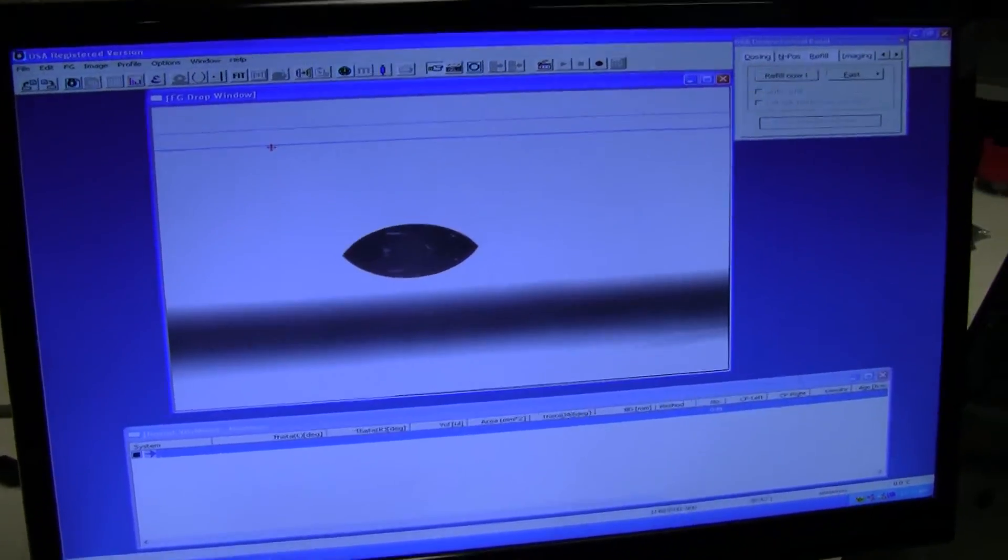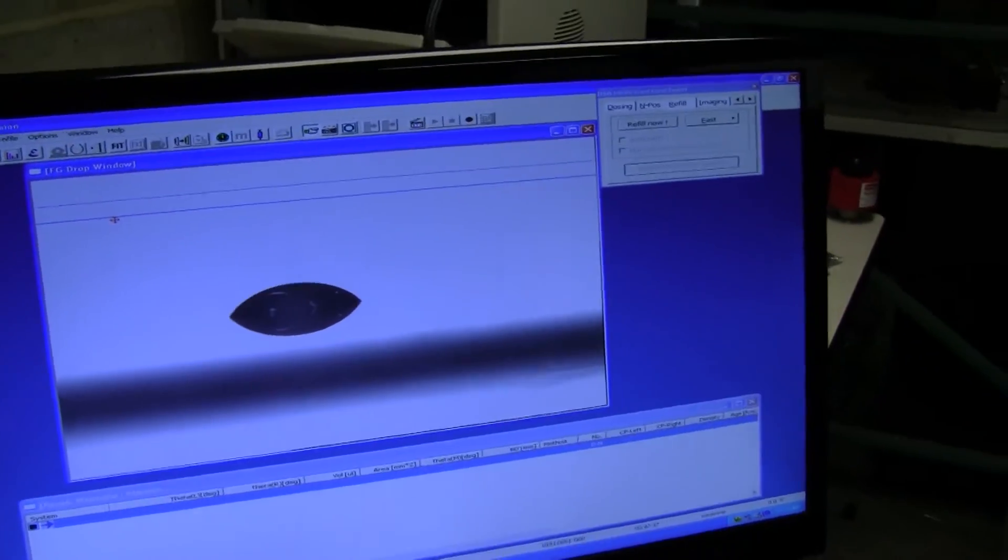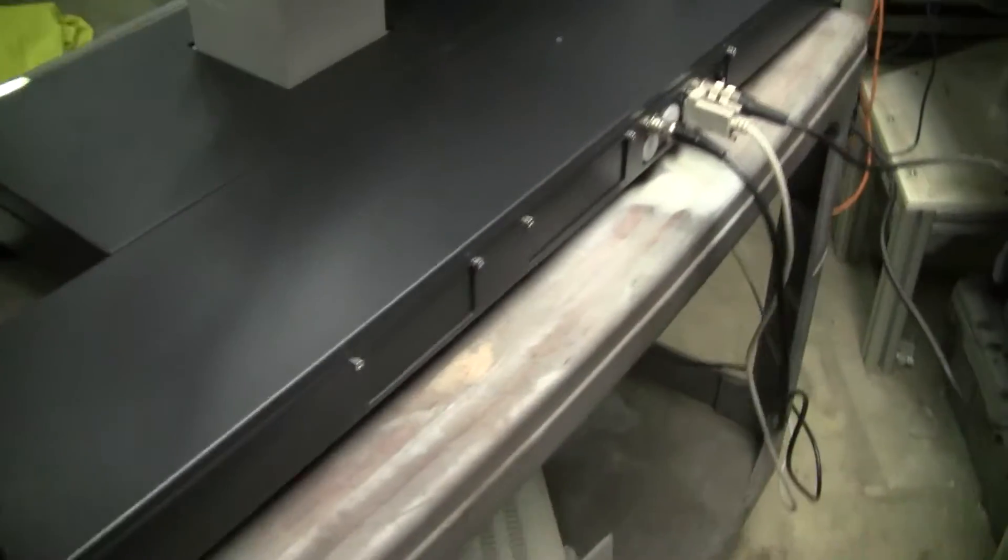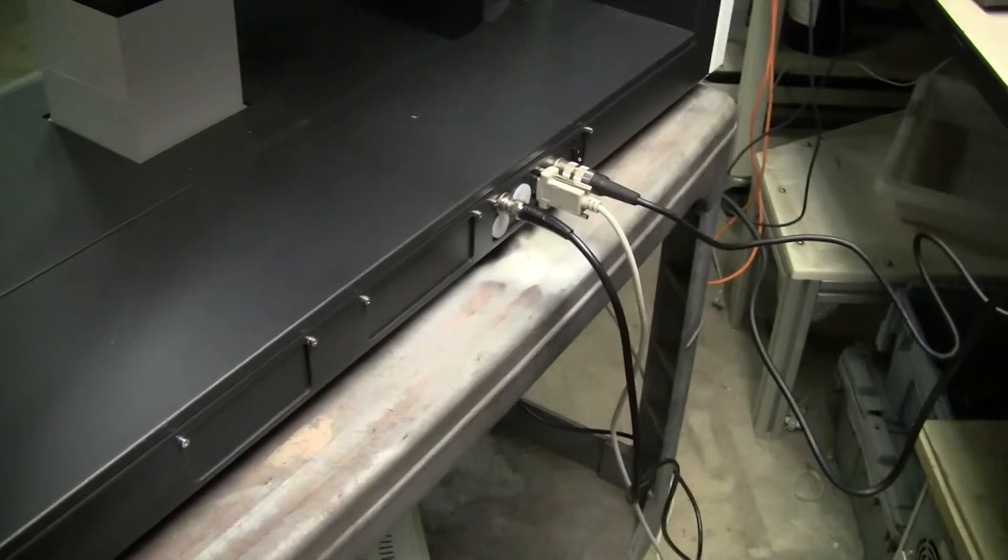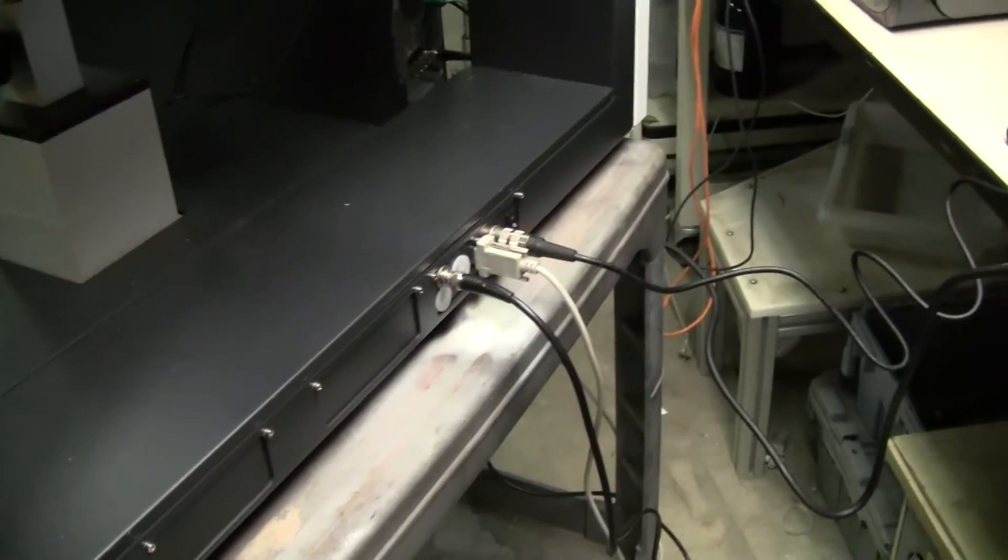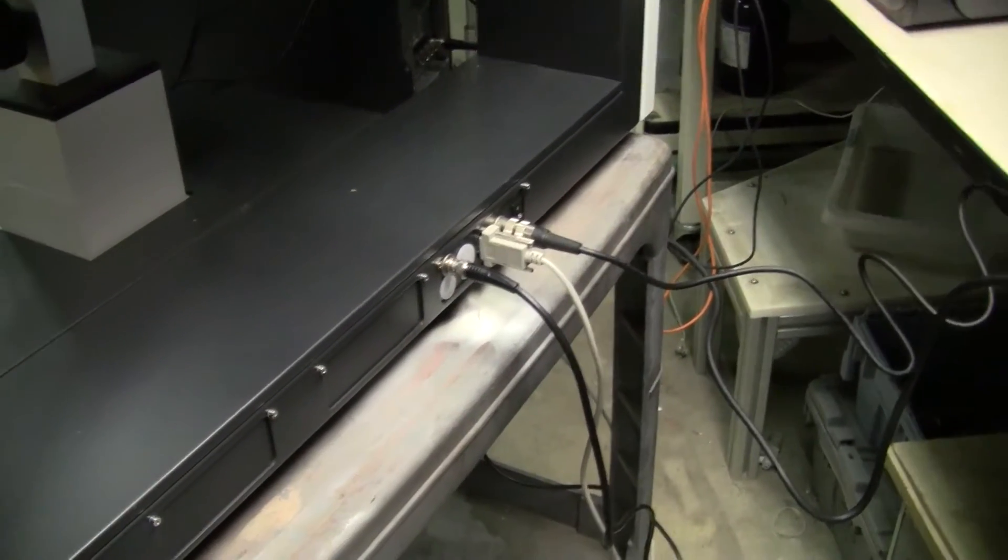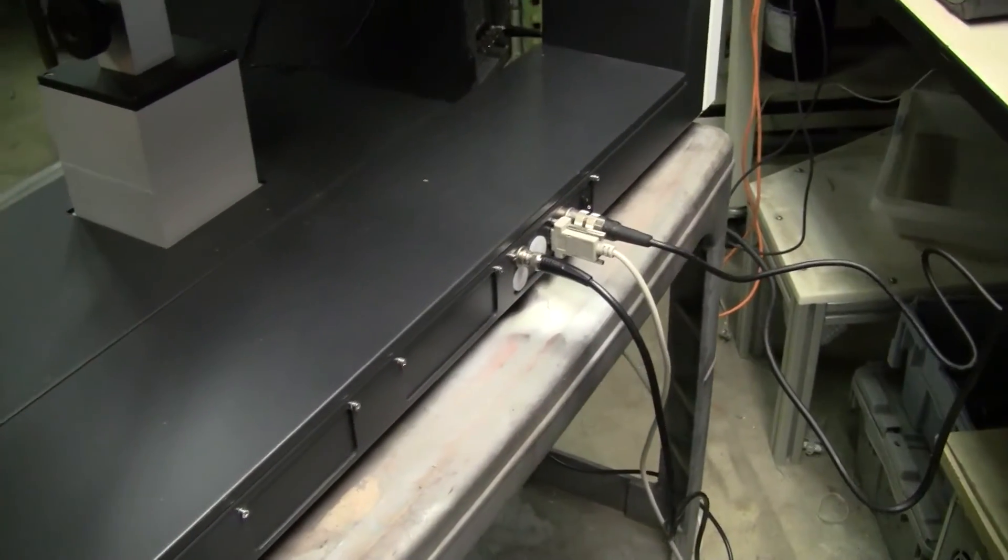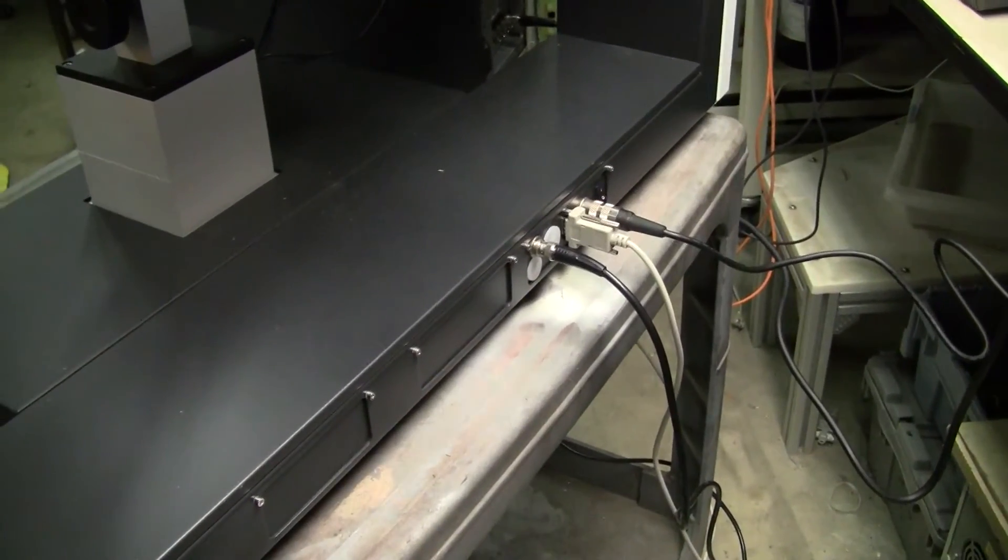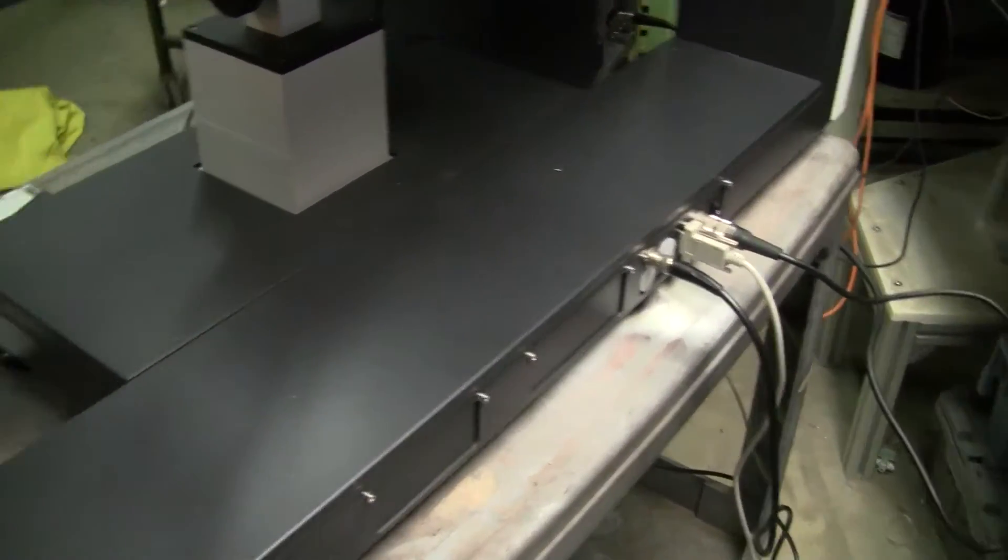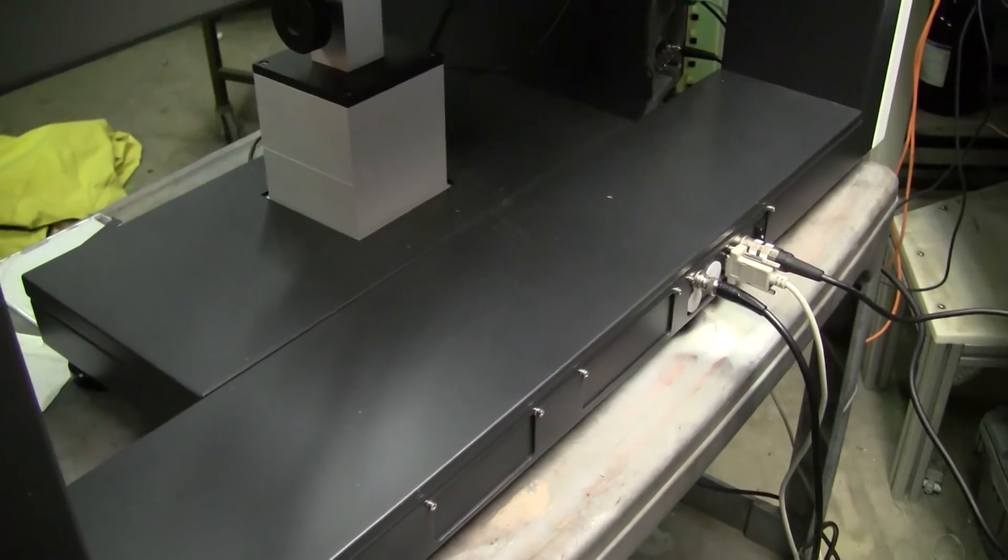It looks to be in excellent condition. It runs on 115 volts. Let's take a look at the setup in the back. Proprietary cabling in. The CRUSS itself has its own power supply.